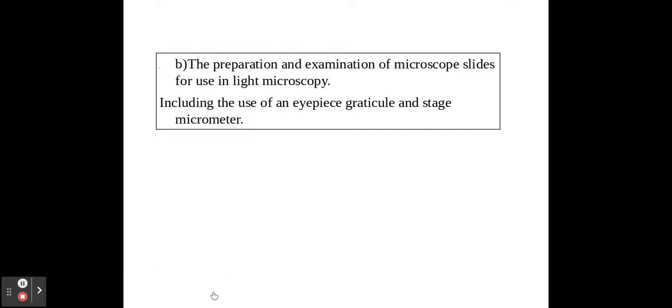Welcome biologists to this session where we're going to be looking at how to use a graticule in the light microscope. This is notoriously quite a difficult task for students to grasp.